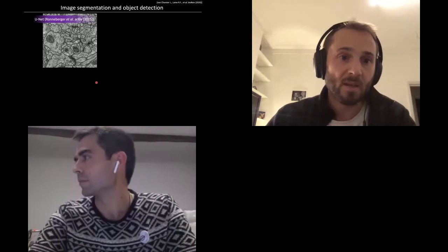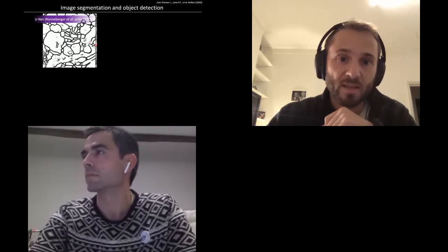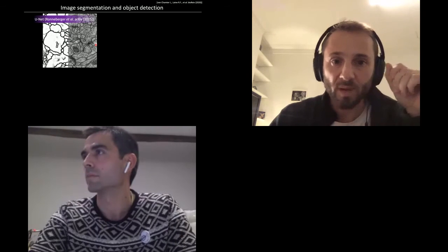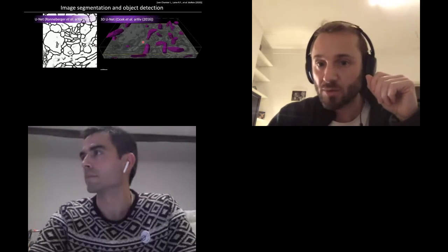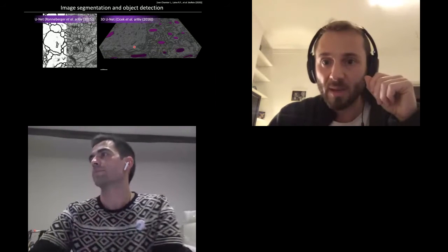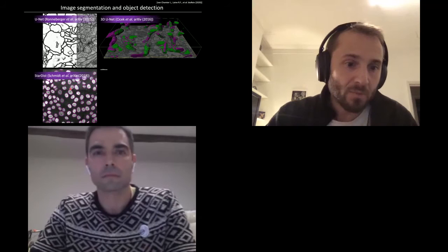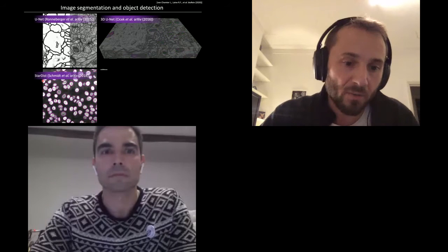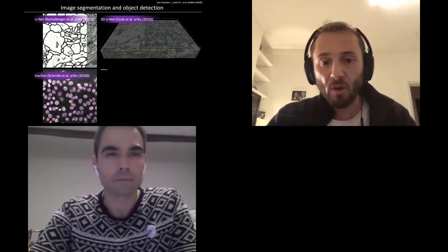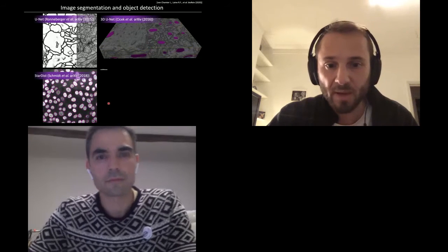So we've implemented classical UNet type of image segmentation. You can see here applied to electron microscopy data, both in 2D and in 3D. So you see here a mitochondrial network being automatically segmented from a trained network, where you see a good agreement between ground truth and prediction. We've also implemented StarDist, which is a neural network developed for the detection of nuclei from, say, microscopy images, including fluorescence microscopy, and that's extremely powerful as well.